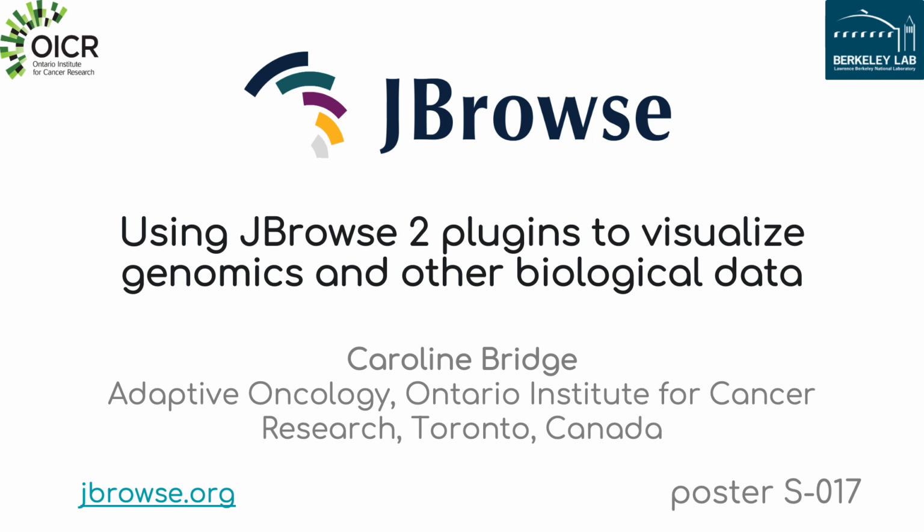I'm a software developer at OICR, and today I will be presenting the JBrowse 2 genome browser, specifically the plugin store and how it can be utilized for visualizing cancer data and integrating biological annotations.